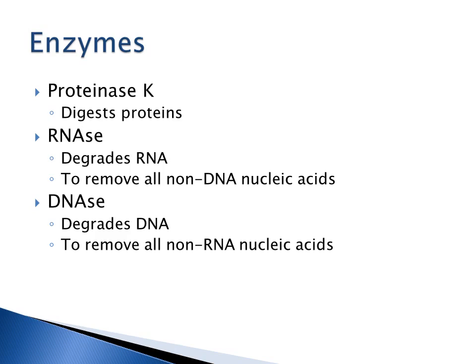When we do extraction, usually you're going to use enzymes. Some enzymes that are used are proteinase K, which digests proteins, RNase, which is going to degrade RNA and remove any non-DNA nucleic acids, and DNase, which is going to degrade DNA and remove all non-RNA nucleic acids.